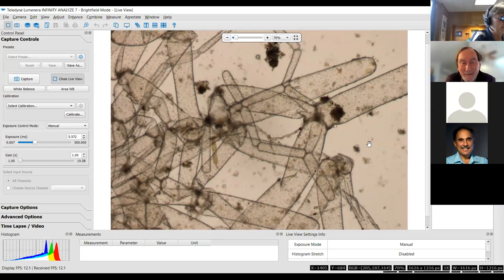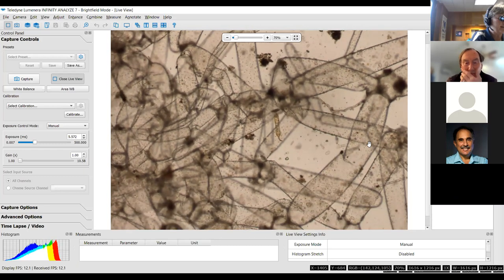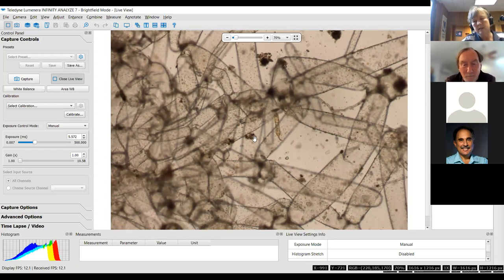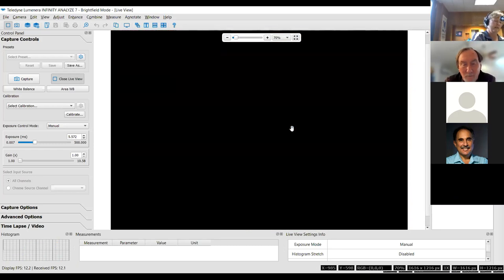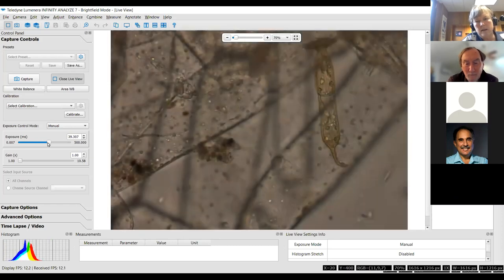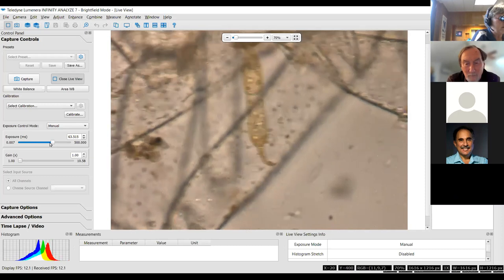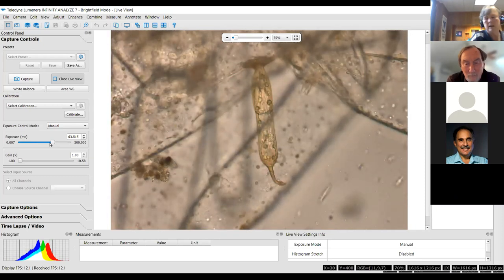So in all of these, and then here's one of those. This is actually cool. See this right here? That's one of those epiphytic greens, and this is a germinating Oedogonium. Those are the pyrenoids. It has a reticulate chloroplast, and there's this attachment disc growing epiphytically on the hydrodictyon, which is always a lot of fun.